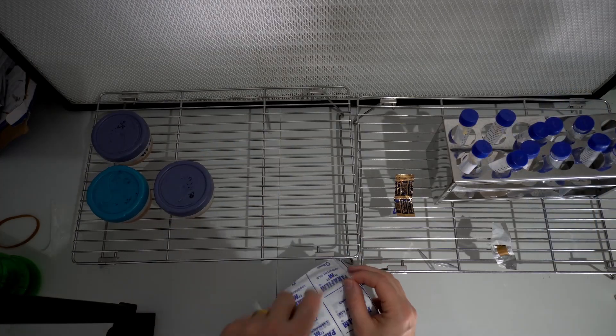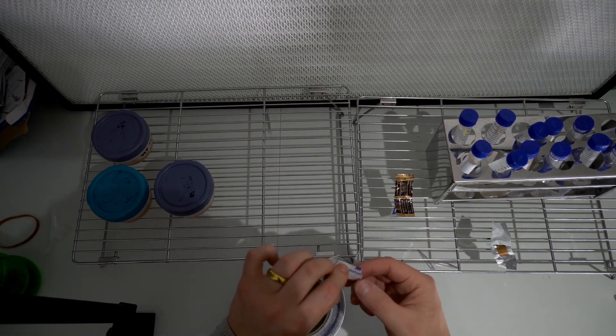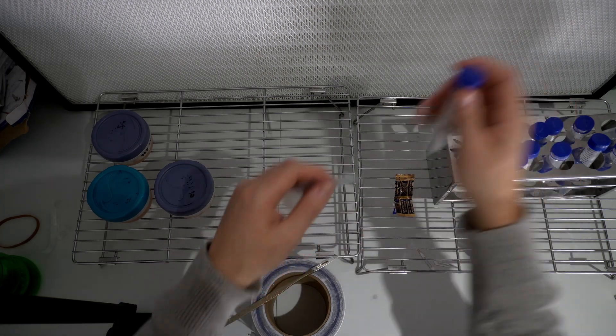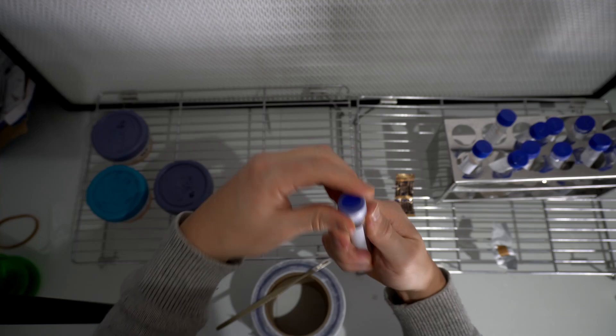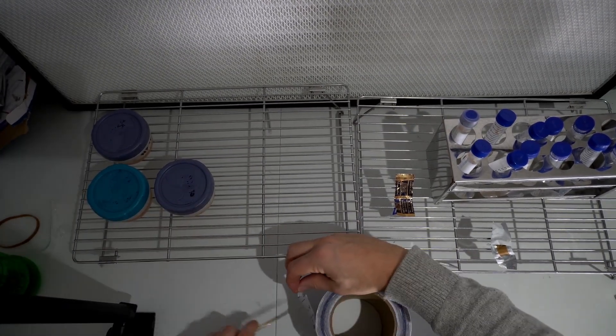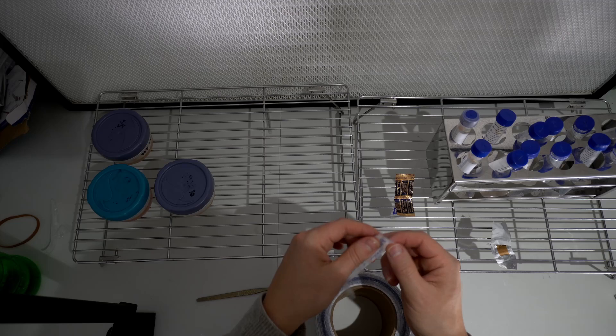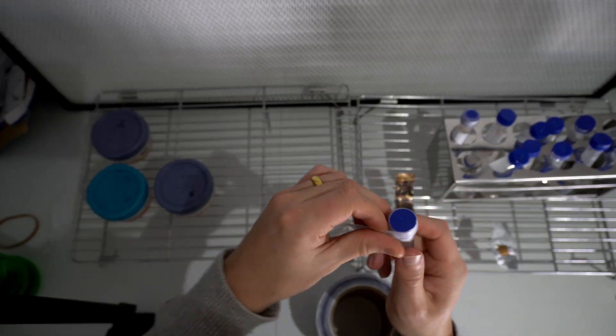Finally, the last step is just to put some parafilm around the lids — or you can use grafting tape, which some people use because it's cheaper. Make sure the lids are on tight and then just wrap it in parafilm. Finally, leave these at room temperature undisturbed, and I'll make another video in the future coming back to see whether Cordyceps can be stored using the Castellani method.